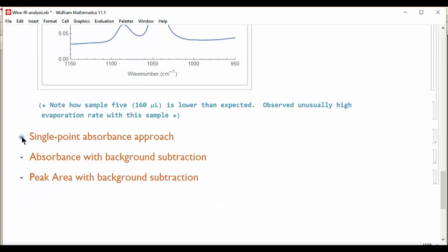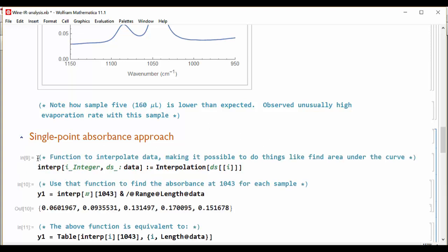So we'll look at a couple different approaches to analyzing these data. First is just a single point of absorbance. I will create a function that interpolates the data points into a smooth curve, and this makes it easier to extract information such as the absorbance at a given wave number or later on in integrating the spectrum.